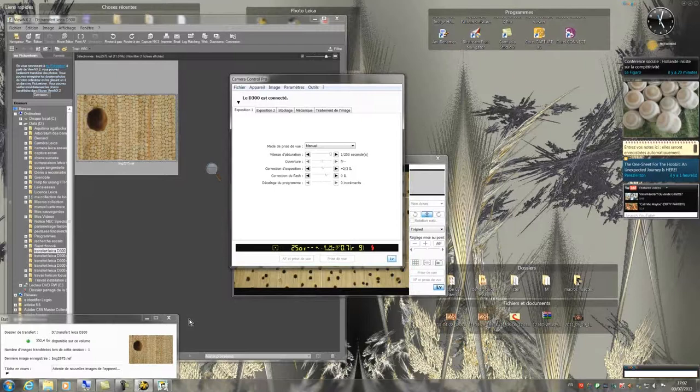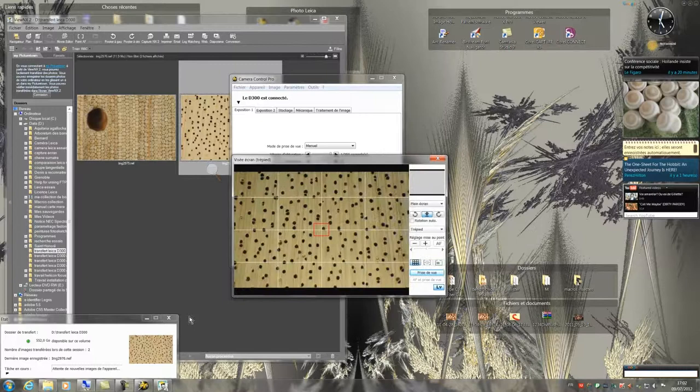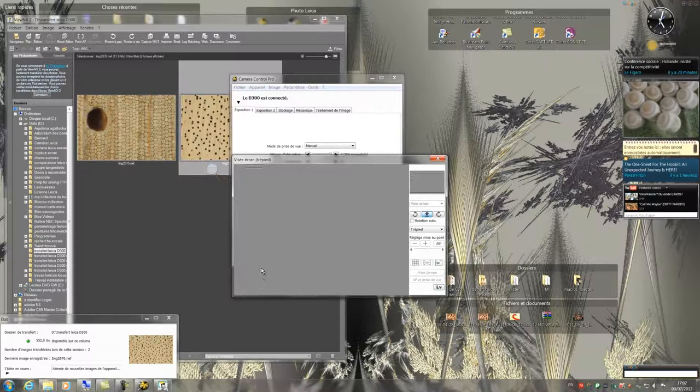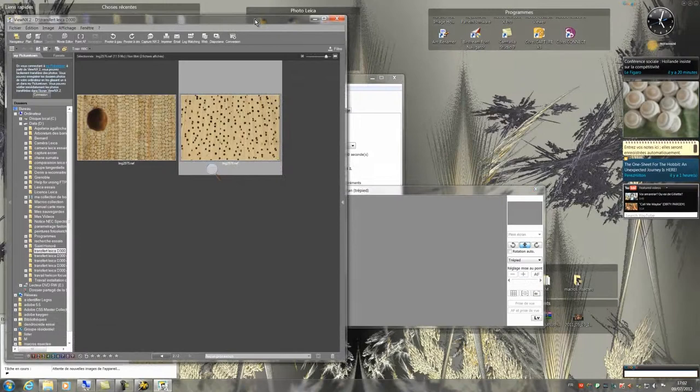Now I take the second picture. Once the picture is taken, I disable the live view to protect the sensor of my camera and avoid it heating. My second photo has appeared in View NX.